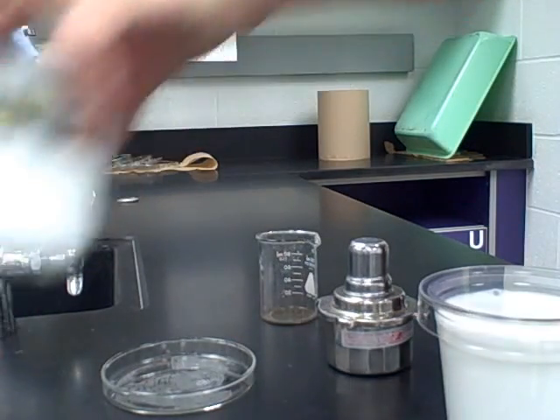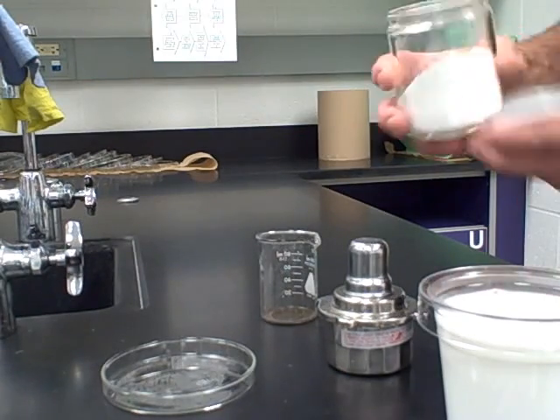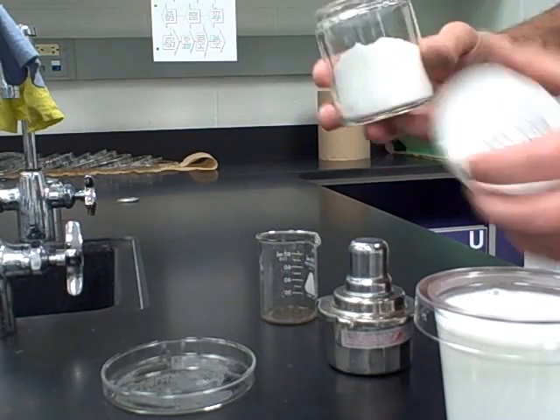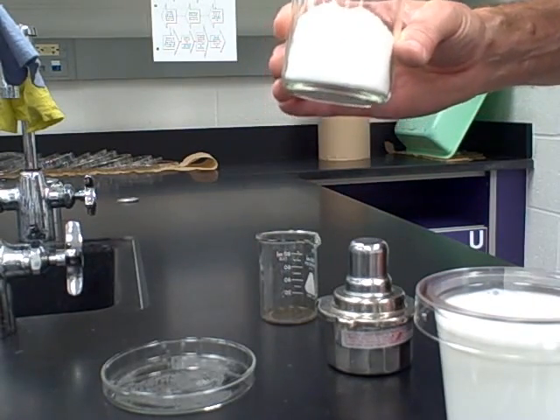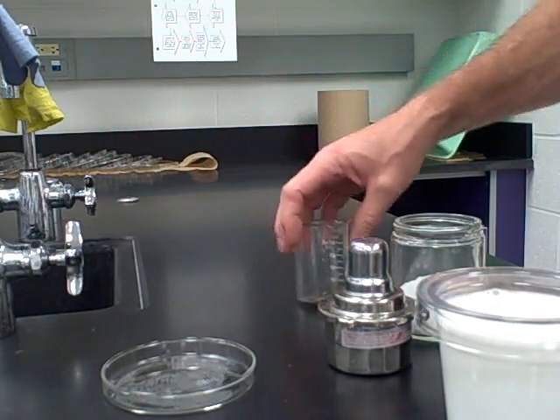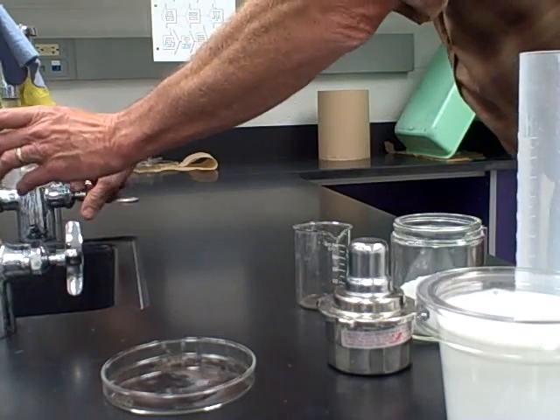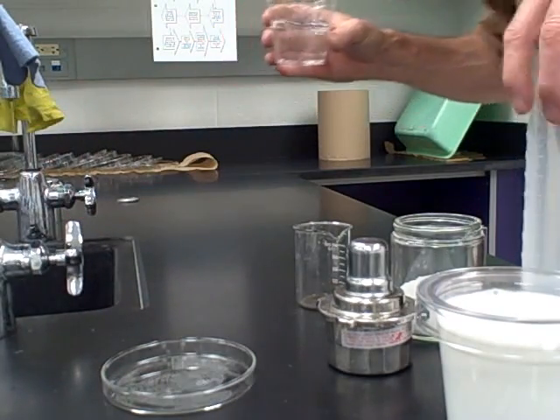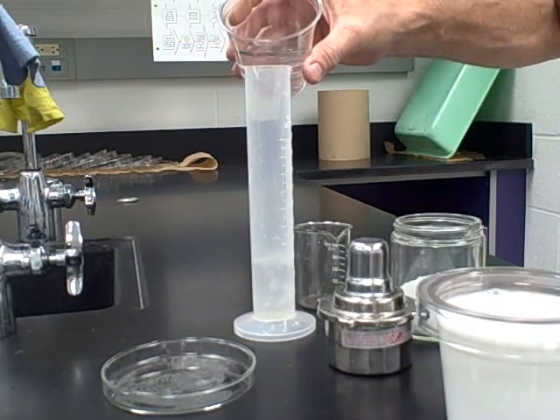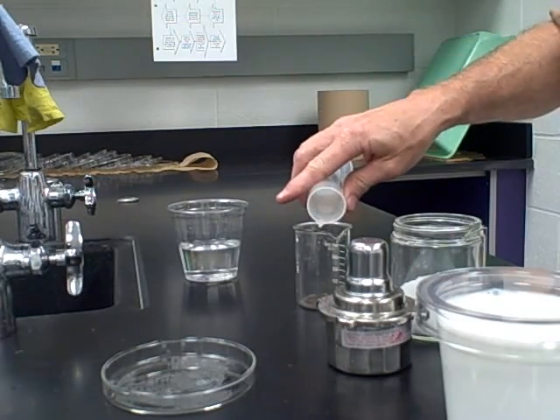Step one says: add two micro spatula scoops of borax — borax is the substance in the jar labeled borax — to 30 milliliters of water in the beaker. Here we have the beaker, so you must first measure out 30 milliliters of water. There we go, 30 milliliters of water in the beaker.